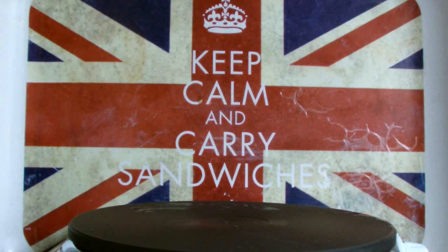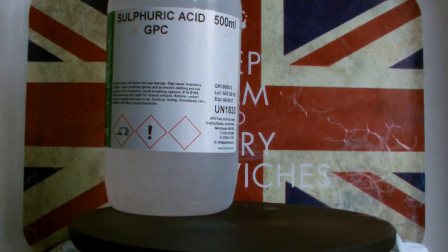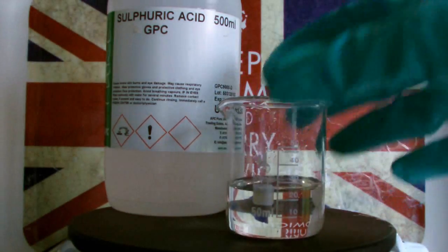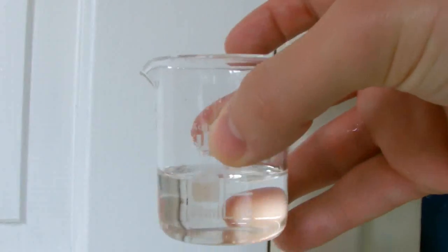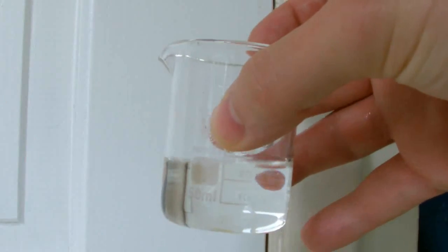Here's the sulfuric acid, which I then added to some water in this beaker to dilute it. When you add sulfuric acid to water, it creates an exothermic reaction which causes the water to heat up.